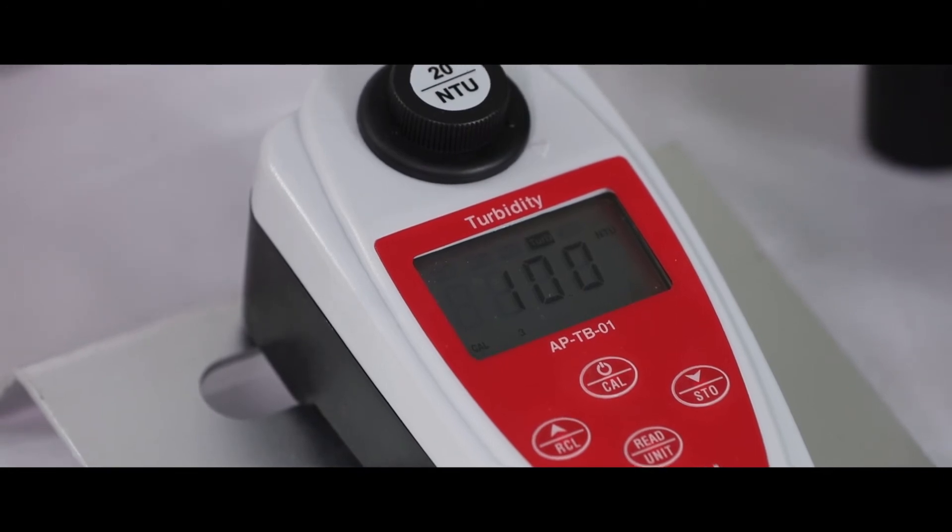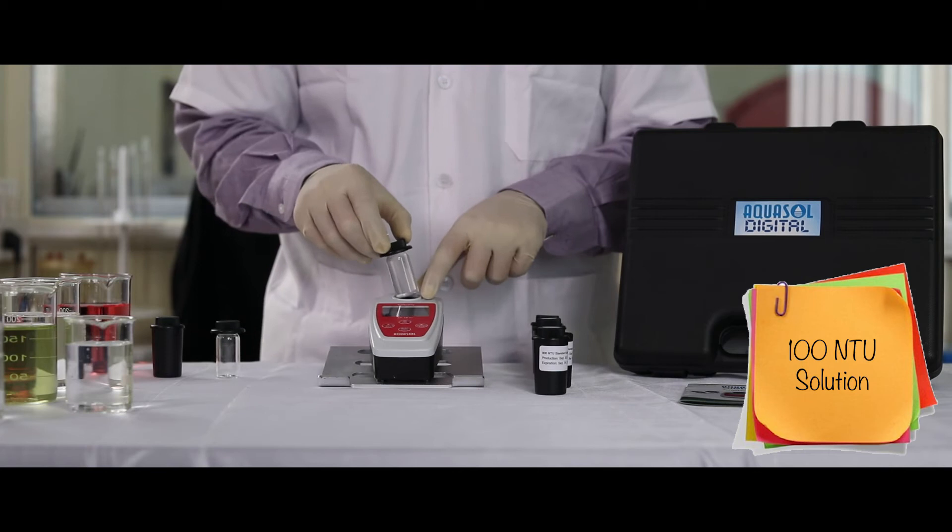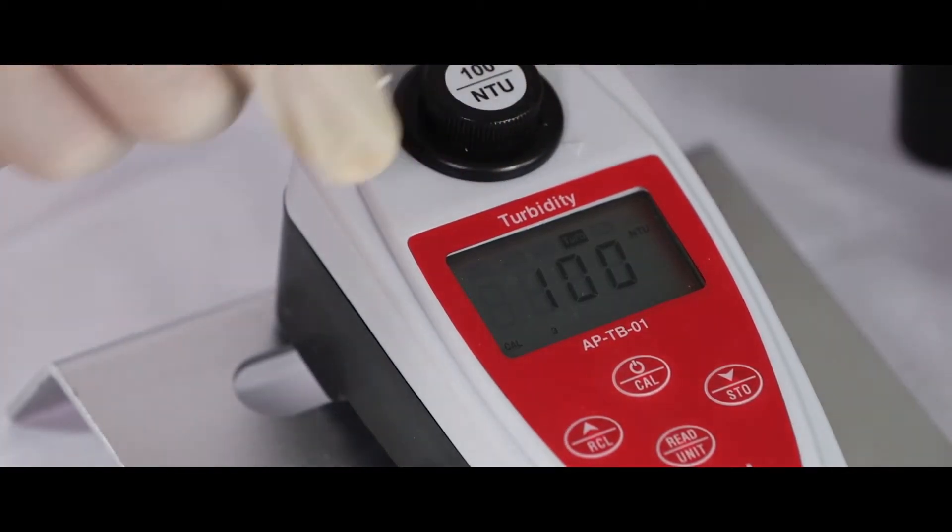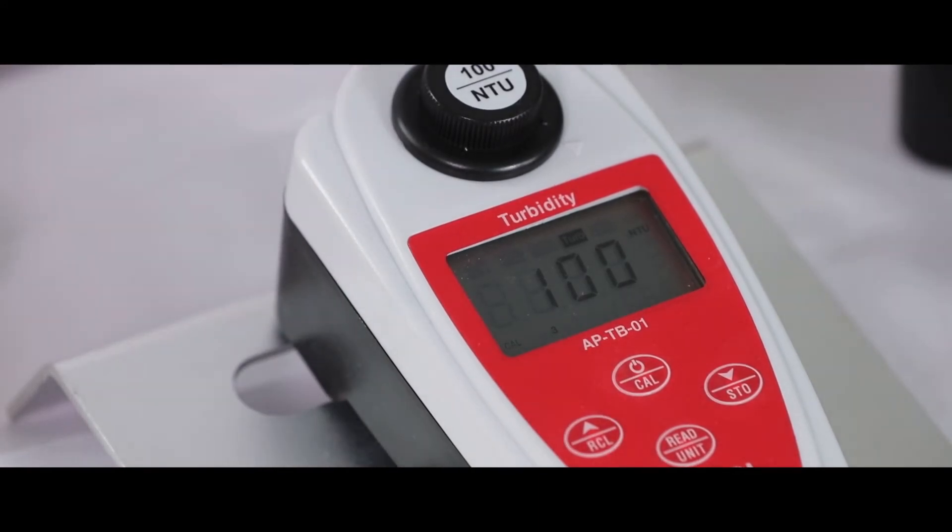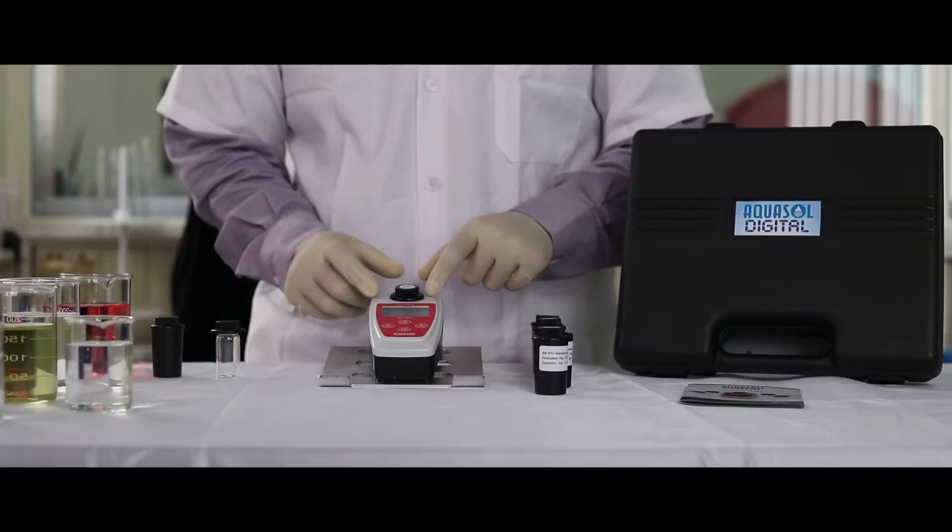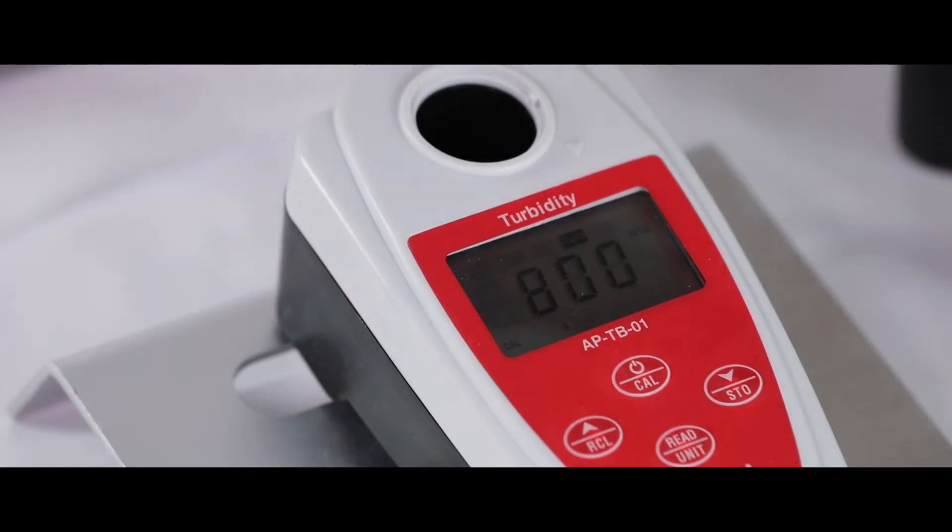To calibrate, replace the 20 NTU with 100 NTU, then press the read key. When 100 NTU is calibrated, repeat the process for 800 NTU.